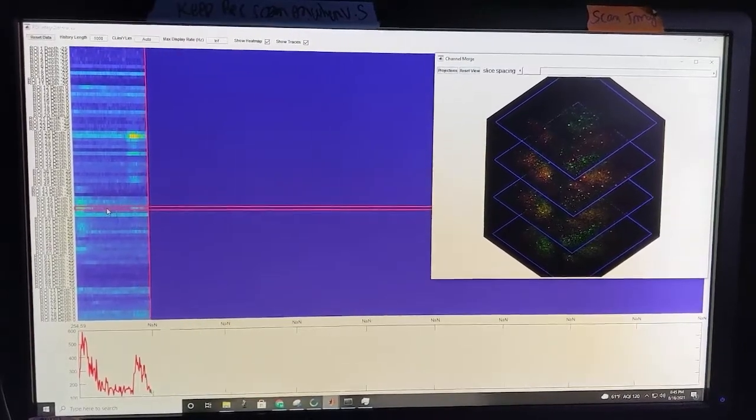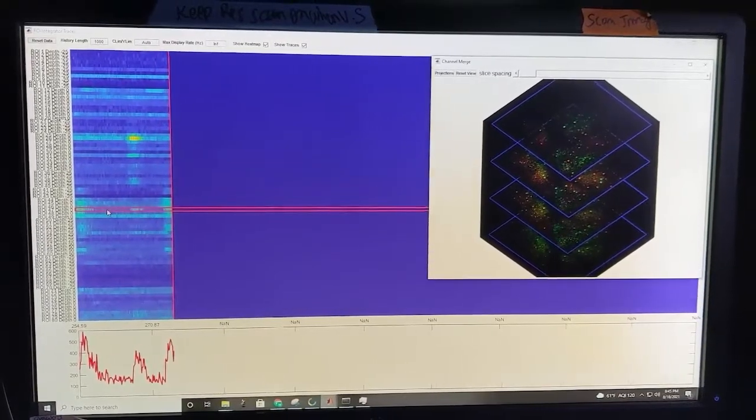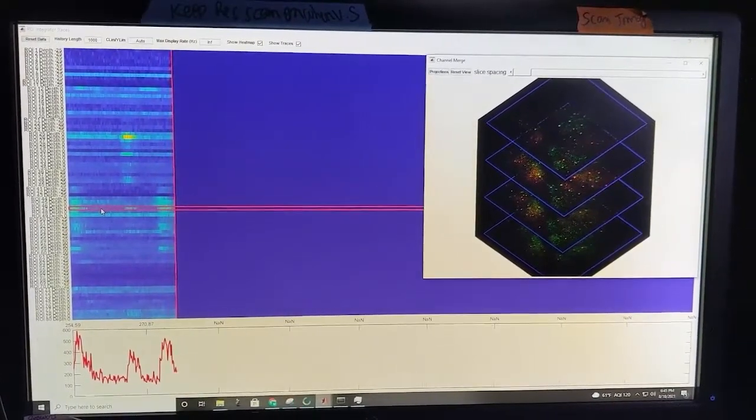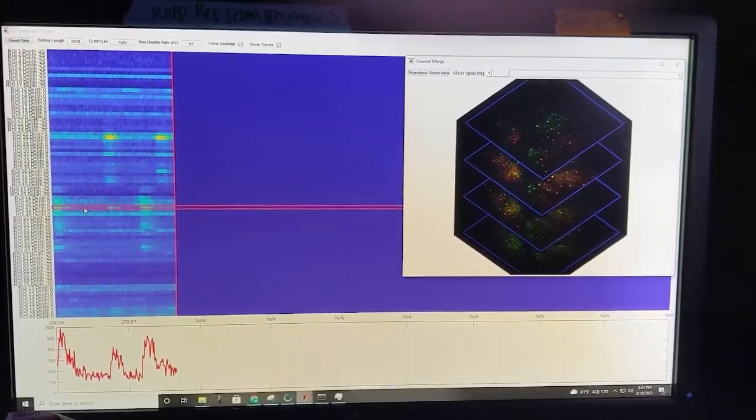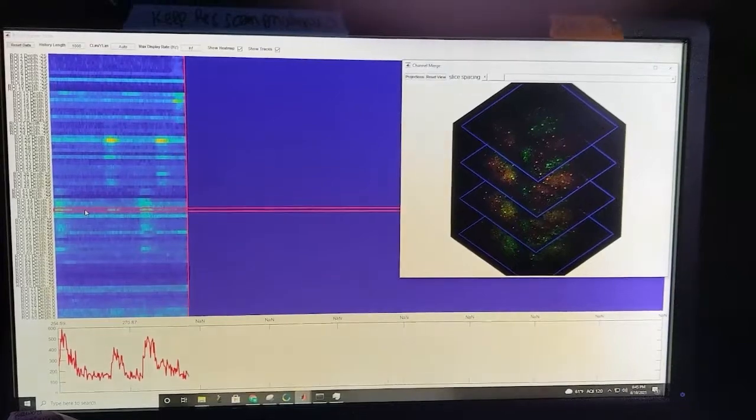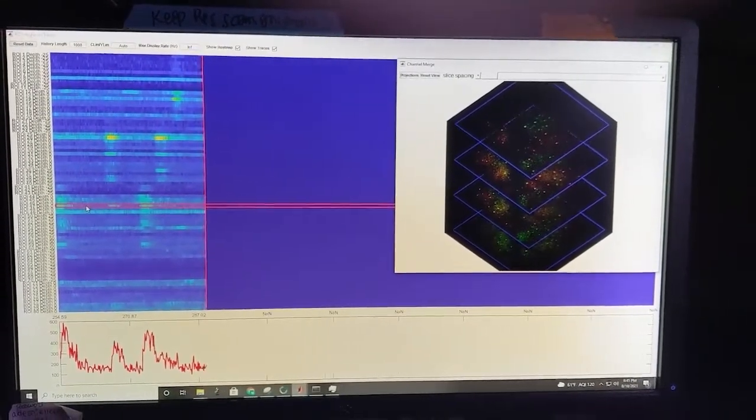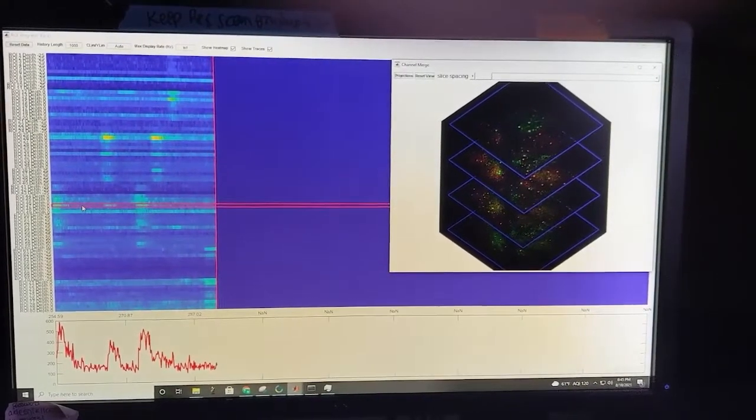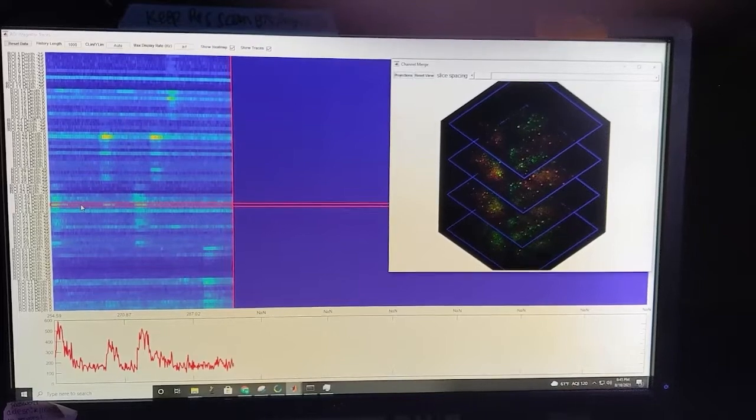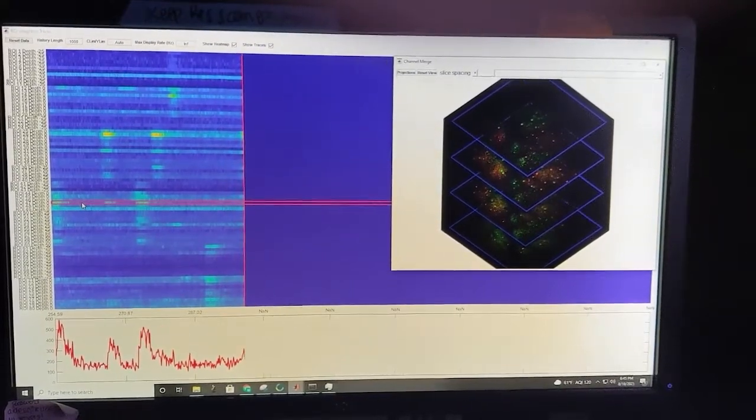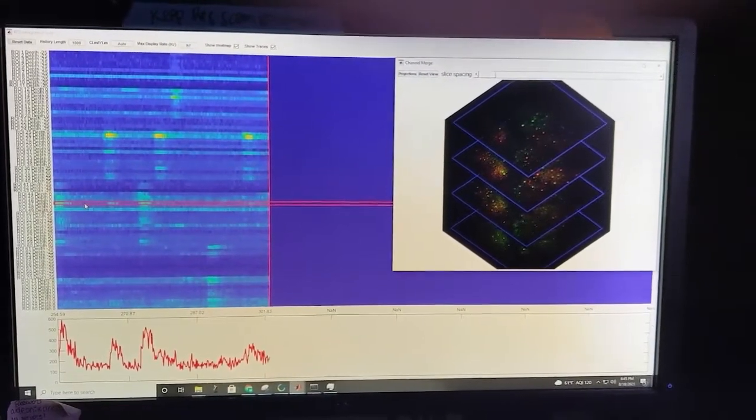So in this video, I'm showing you an example of two of the tools that Lamya just described, which are fast multi-plane two-photon calcium imaging that allows us to record thousands of neurons simultaneously. And our multi-target stimulation system 3D shot. So on the right, you can see the four planes that I'm recording at 8 Hertz. And on the left, I'm tracking the online activity of 200 of those cells that I chose based on functional properties of my interest. You can see how I can activate these cells in groups of 50 cells at the same time.